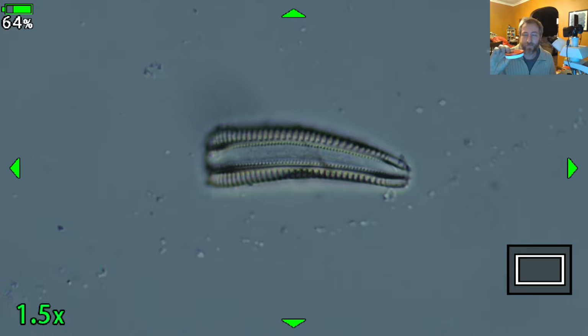And in diatoms, the girdle bands are sort of spacers that go between the valves. And you could have a bunch of them, so it could expand the height of the valve. If it wanted to be a taller valve so that it could make new valves inside of the old ones and split, it could. This one is kind of neat, though, because we're looking at it from the side, we see that it's actually arc-shaped, which means the valve face has a depression on one side. It's concave on one side, and the other valve is convex. So that's actually pretty cool.